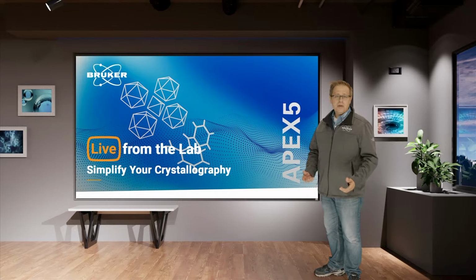This is the show where we talk about different technologies that Bruker's developed to help scientists around the world make new discoveries. Today's episode is about single crystal diffraction, in particular our Apex-5 suite of different software tools, and one of the most important new additions. Now you could go to all the work of making the crystals, then measuring the structure, refining it out, but what do you do at the end? That is the question that we're going to be solving today.